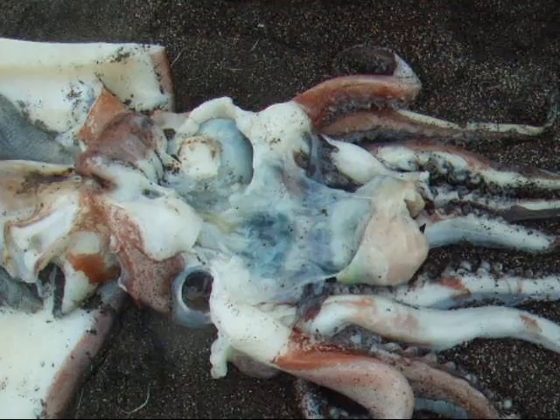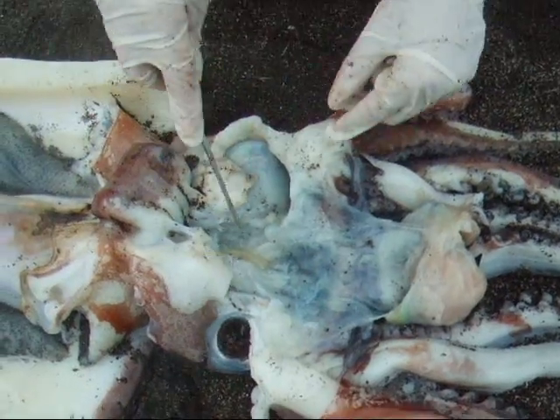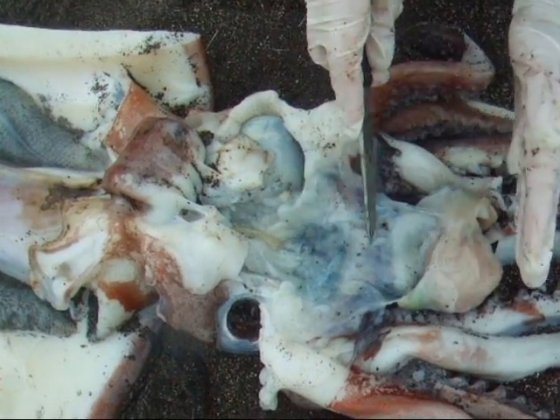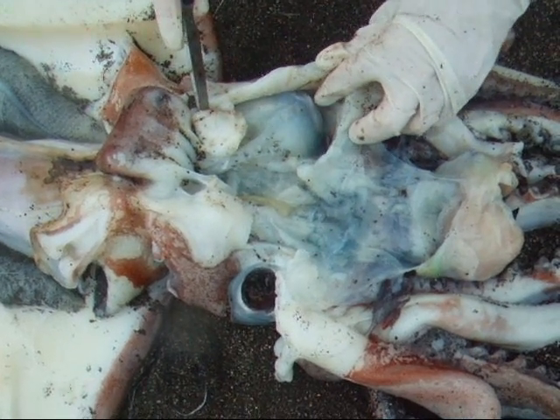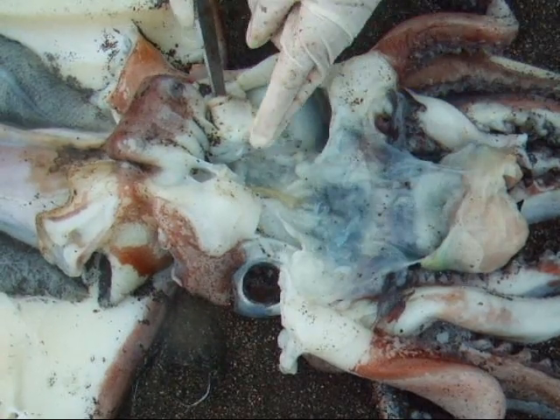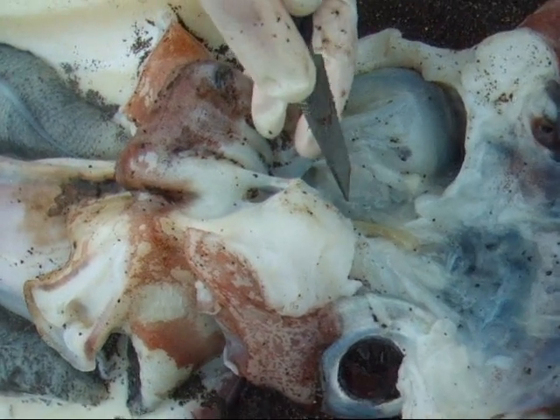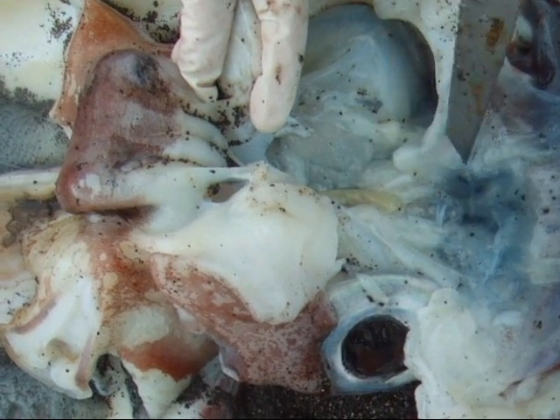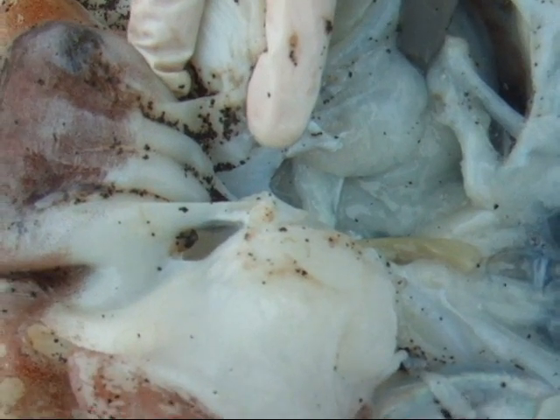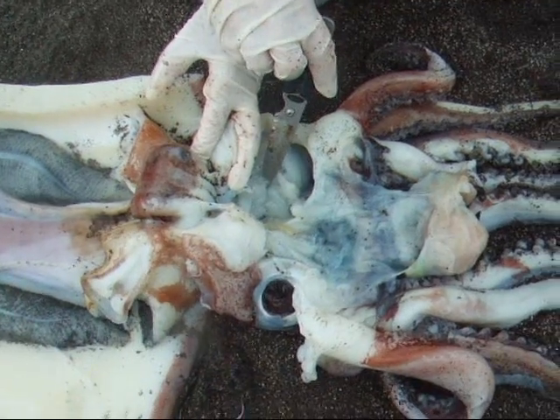I've opened up the cranium, which is hard cartilage, and cut away the mouth and esophagus so that we can see the optic capsules. You can actually see the optic nerves right here. And underneath all this mass down here is actually brain matter — it's all ganglion.